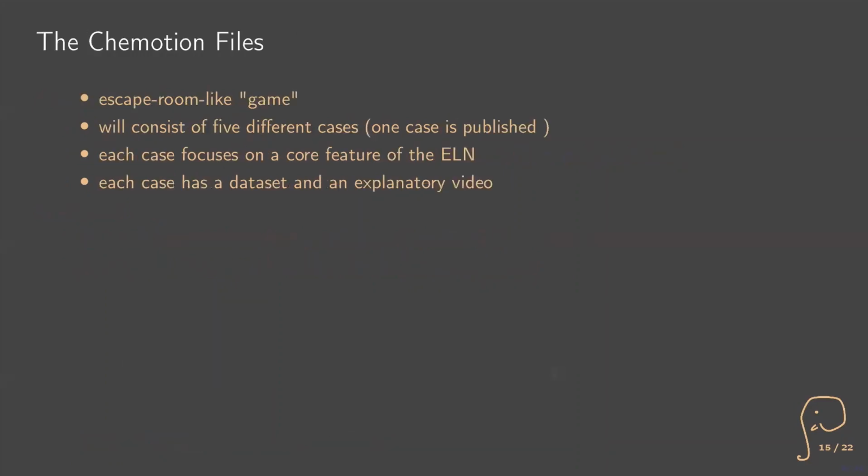Okay, and now what are the Chemotion Files, right? As I said, I tried to take gamification and put it together with an electronic lab notebook to have a maybe fun and interactive way of teaching specific things in an ELN. So the Chemotion Files is an escape room-like game, if you want. You have to solve riddles to get to the right answer, and so on and so forth. In the end, the Chemotion Files will consist of 5 different cases. One case is published, another one will be published at the beginning of next week. And these 5 cases will have a small overarching story, so that it's all connected a little bit together.